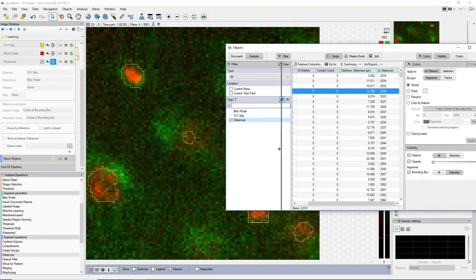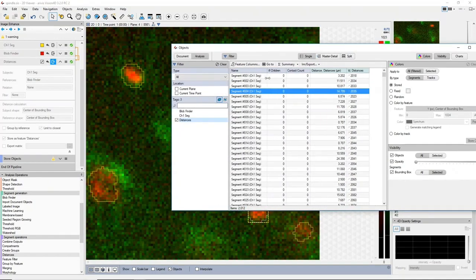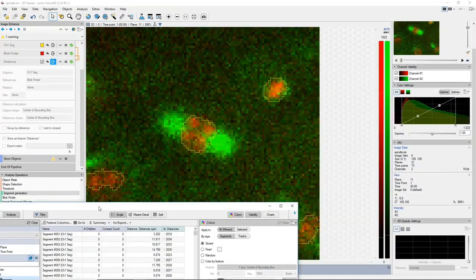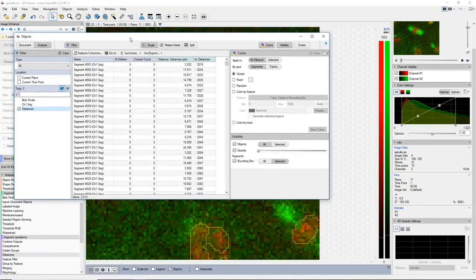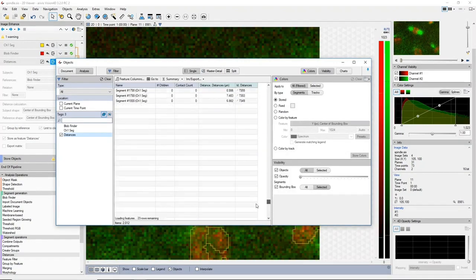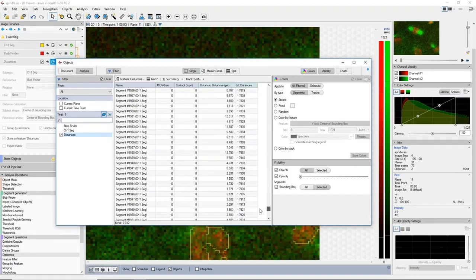2035. So if we have a look, make this table a little bit bigger, we can go to the object, and we should be able to see that object. And oh yeah, because it's a reference, it's going to be one of those.